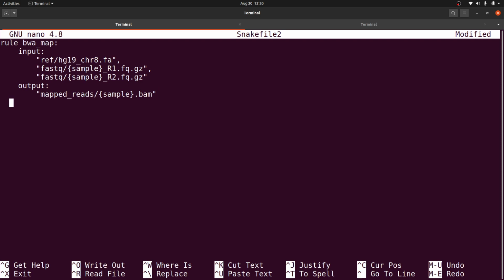Now we bring our shell. That one you know the drill already. In the shell, we bring double quotes. That will be BWA mem. You bring your inputs, and then you bring your other options.